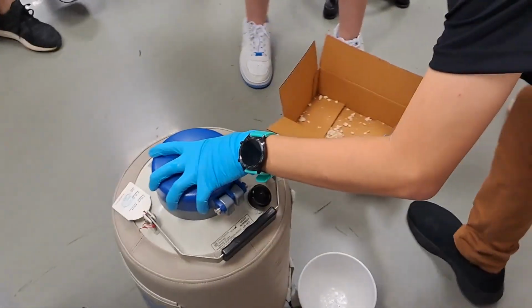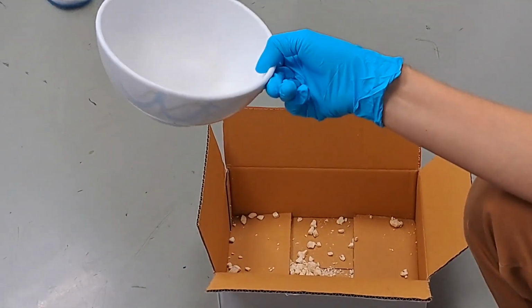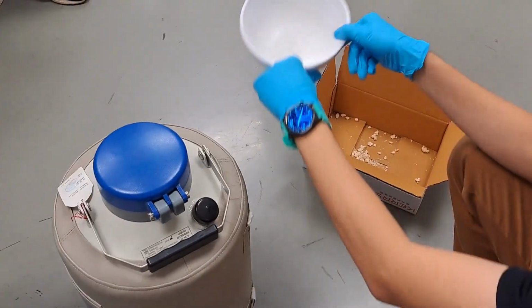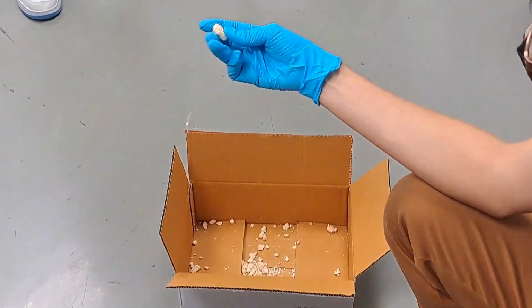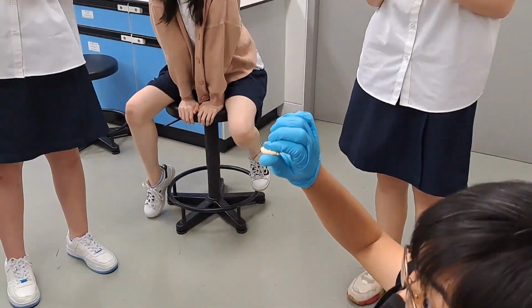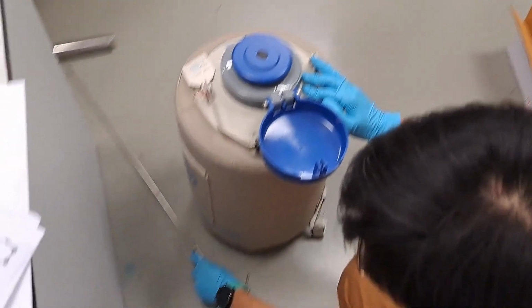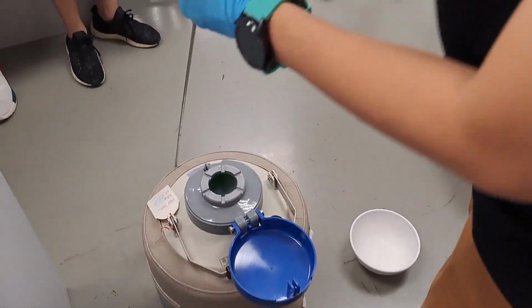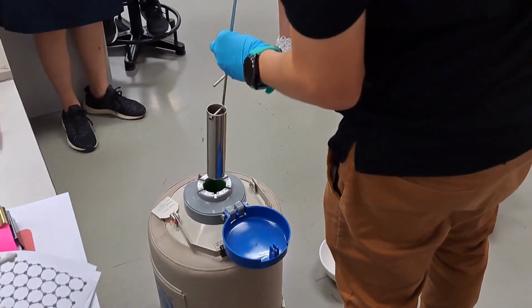Alright, I will put the liquid nitrogen, you have to see that it is liquid, into this cube bowl. Put the marshmallow there and then try to smash it over here. This is from yesterday, but the marshmallow turned back to room temperature, so you can squeeze it again. That's a lid.